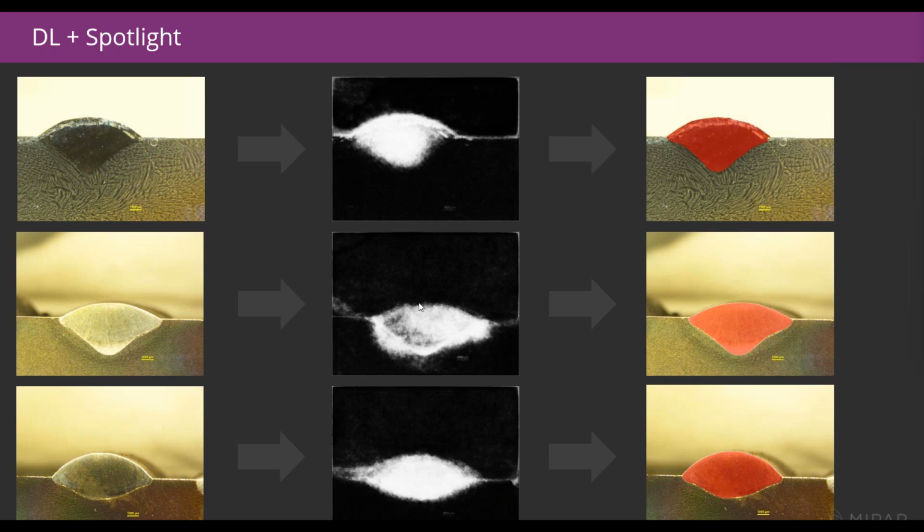In this example, I think it took maybe 30 minutes to train this model on 20 or so different examples, but that time is very much variable on size of the images, number of images, and your computing hardware. So we see training times range from anywhere from 5 minutes up to 12, even 24 hours for the really massive data sets with maybe several layers of annotation. So it's quite variable, but in those high time cases, of course, much of that can happen after hours overnight.